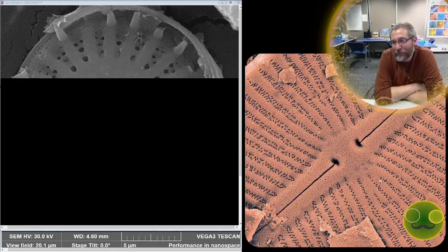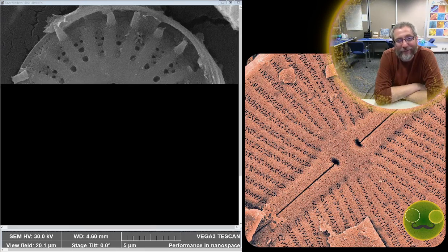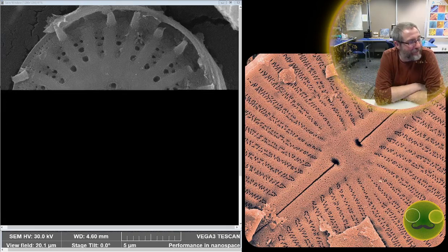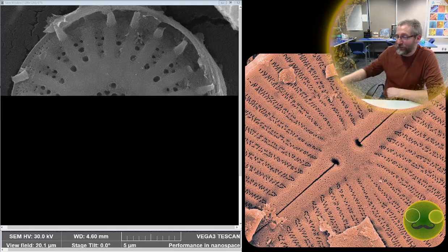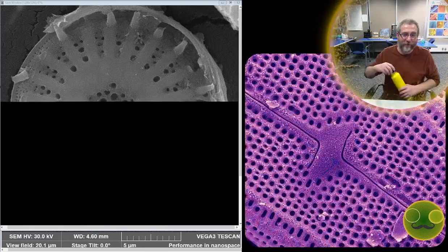You'll have to set your weapon to stun to prevent them from wriggling. I wish I had a stun inside there to keep things from wriggling, but I just have electrons inside the chamber, and so I can only zap things and destroy them slowly, unfortunately.